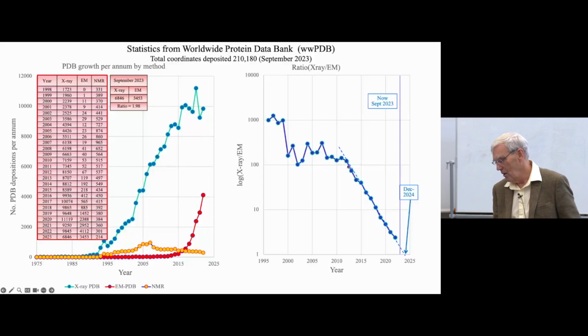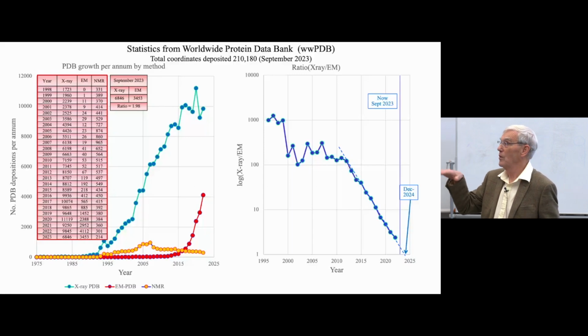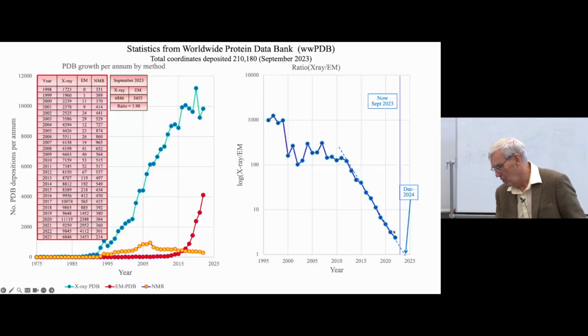But since 2013 or so, there has been, of course, growth. In that year, there were only 3 labs in the world that had equipment good enough to do those structures. But gradually, people have bought more, and there are now hundreds and hundreds of these. And here in York, there is one of these new high-resolution microscopes, the Glacios. And I think, obviously, York may be thinking of having more. But anyway, it's grown and grown and grown. And so now, worldwide, it's about 2 to 1.